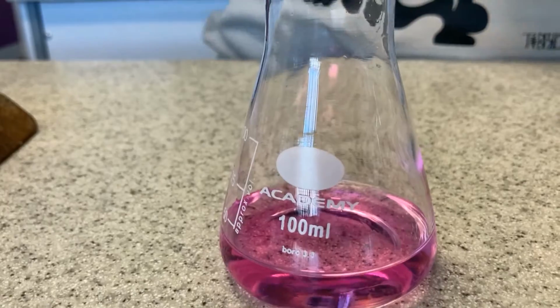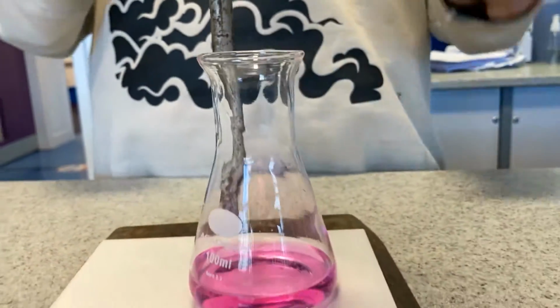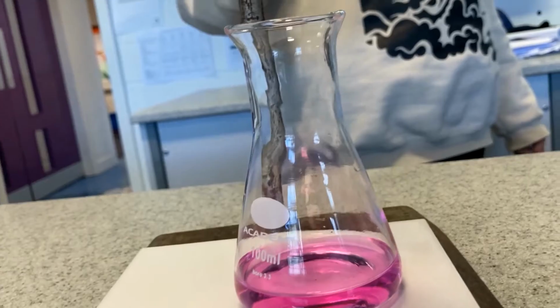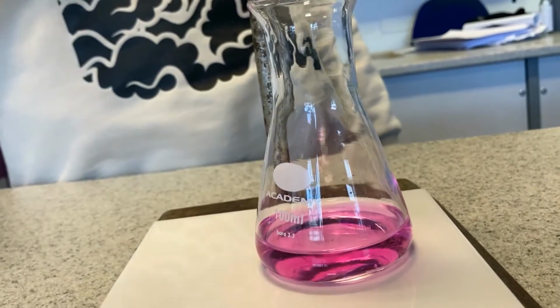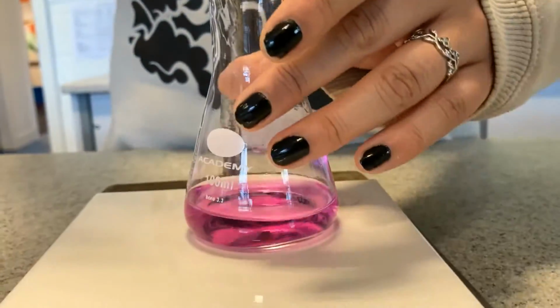Okay, so what we're going to do, take our 25 millilitres, put it under the burette. Why have you picked that one rather than universal, miss? Well, it changes exactly at 7. Oh, right. So that's super useful, isn't it? Okay, yeah. So we don't care whether it's 8 or 9 or 10. We care if it's 7. Gotcha.